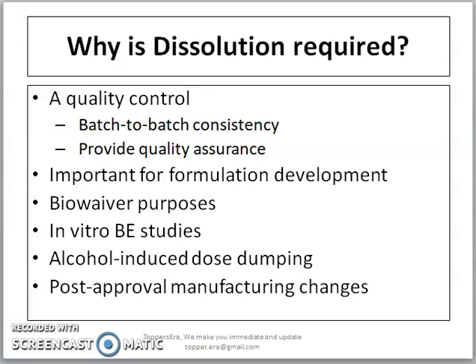And dissolution testing is a key parameter for in vitro bioequivalence studies and post-approval manufacturing changes. This can also be used in understanding alcohol-induced dose dumping.